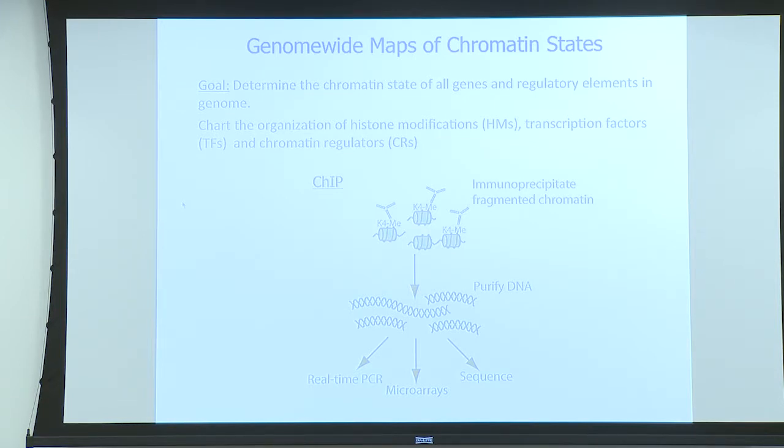So since open chromatin is more sensitive for shearing, if you look on, for instance, the whole cell extract, there's more enrichment for reads over the transcription start site, over the promoters, because it's more of an open chromatin. So we do get some kind of a bias, and it's good to know it.